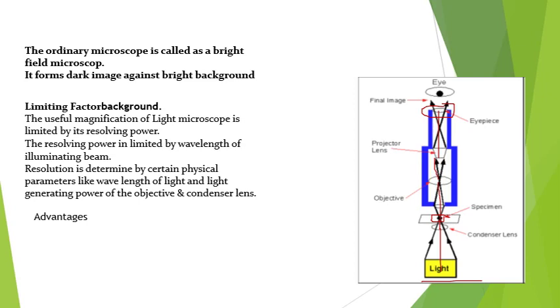So for this purpose we stain our specimen to find a clear image. So this is all about a brief description of bright field microscope.